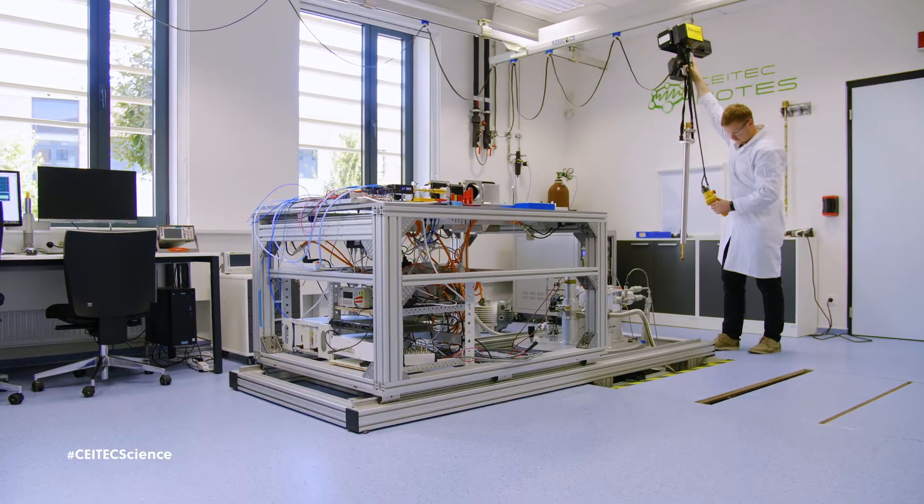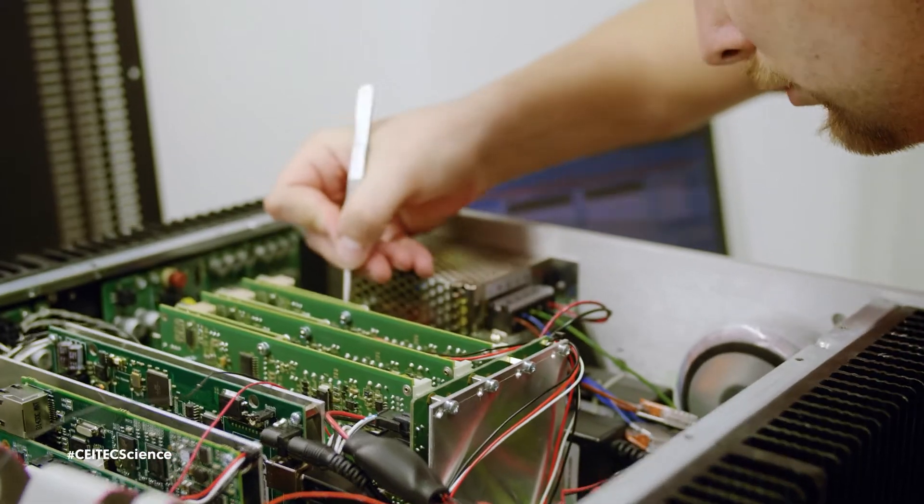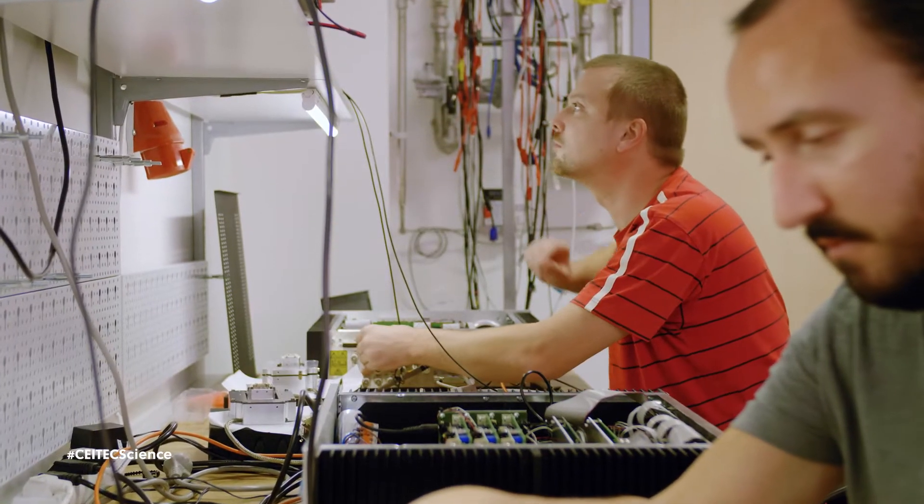Our research infrastructure is a central hub for shared resources, which provide the academic and scientific community with the use of the latest instrumentation and services.